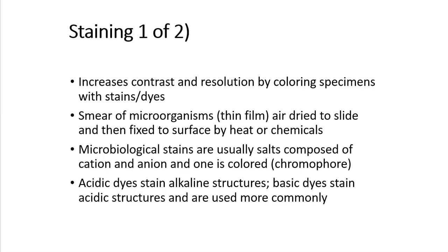So we take a thin smear of these organisms, apply them to a slide, then we fix it. We have to heat it. These stains are water-based, and I don't know about you, but you put water on a slide, it's going to wash off. So we literally have to, quote unquote, fix these organisms to the slide.